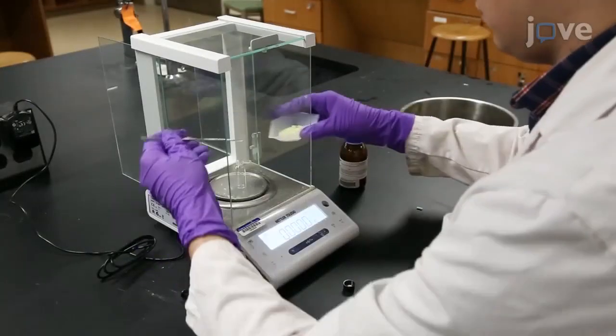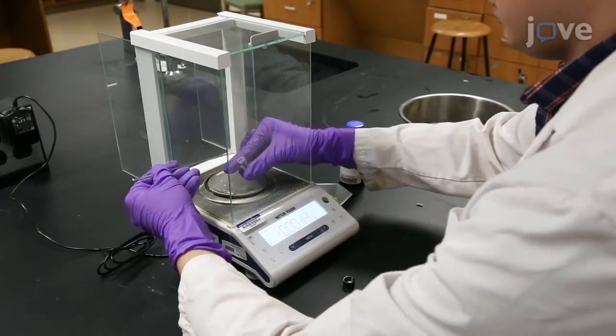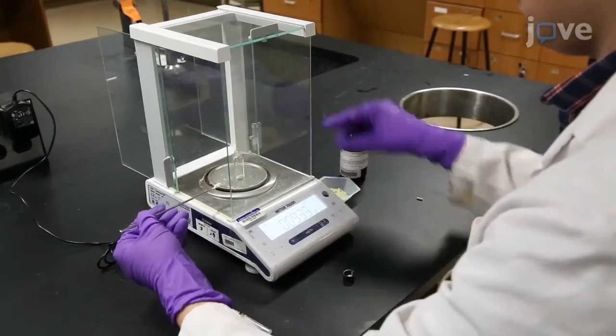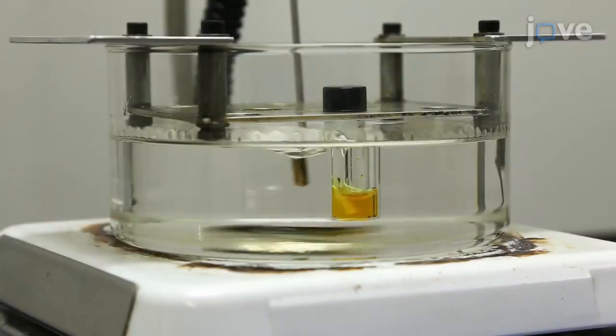To prepare poly(sulfur-divinylbenzene), combine elemental sulfur and divinylbenzene at the desired weight ratio in a 1-dram vial equipped with a magnetic stir bar. Place the vial in an oil bath at 185 degrees Celsius for 30 minutes.